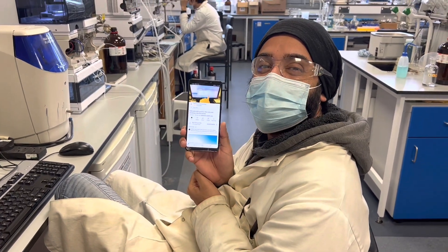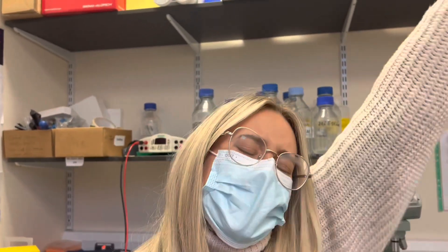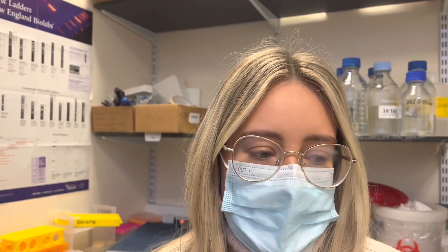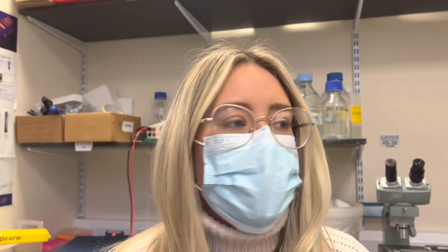Good morning, it is Wednesday and today is my last day of being in the lab. I don't think I'll be here all day — I'm just going to be tidying things up, drying some things, and maybe do an NMR of my peak collected from the HPLC on Monday. Yesterday I went home and did not work on the paper because the positive vibes were not flowing — I was very tired, feeling a bit stressed. As everything is changing every day with the omicron situation it's making me stressed. But today is a better day, a day of positivity — we're going to get some stuff dried, maybe get an NMR, and I am going to work on the paper today, whether it's in the lab or at home.